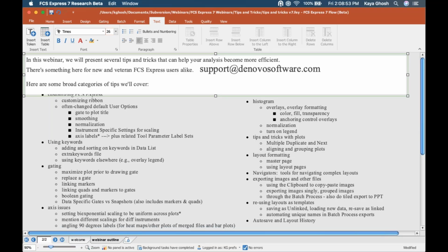Okay, so now I'm going to take a look at the questions. I see Robin has been doing a great job answering most of those. And then there are some at the end that are maybe a little bit off topic from what we're talking about. So one question about compensation. We're doing a compensation webinar next week, which is a little bit more in depth, so I would say join us for that webinar next week if you can. And if your questions were urgent, we can follow up with you via email, or just email us at support@denovosoftware.com with your question.